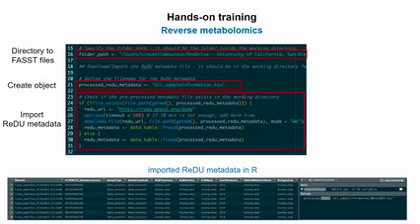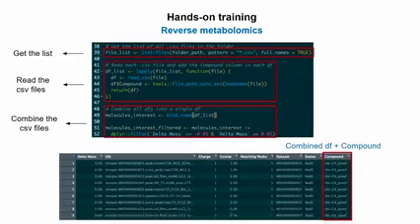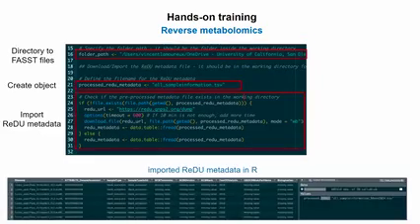I'm just going to go through the code, so instead of just pressing a button, you know what we're actually doing. This is just a basic script where you can customize probably everything you want. But it will at least give you different body part distributions of these 3 different molecules, and whether they are associated with a specific disease. So the first step is just to load. You have the folder path here.